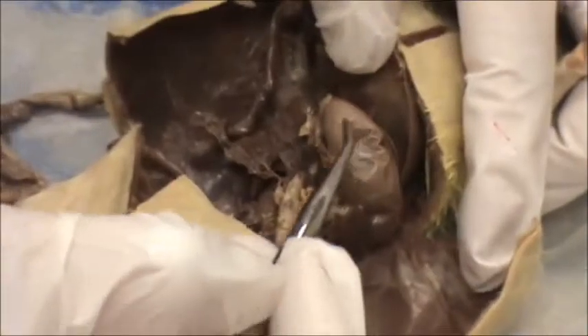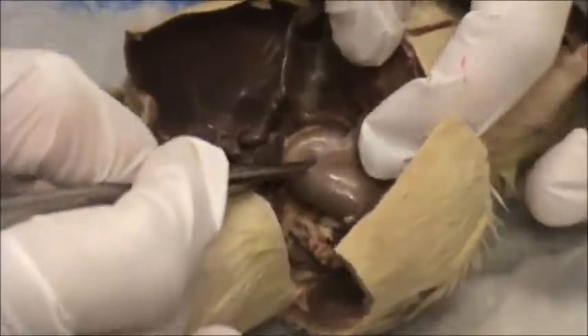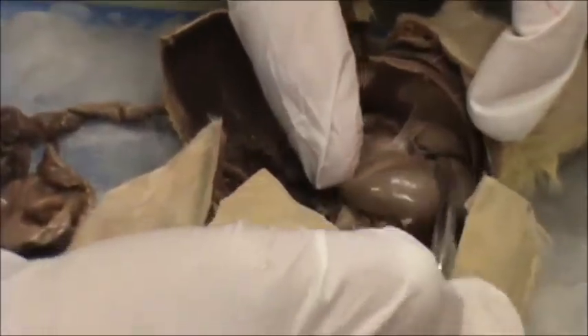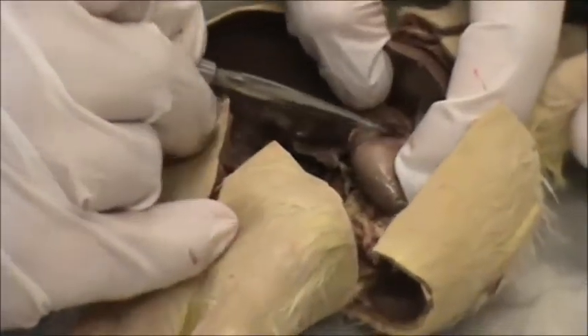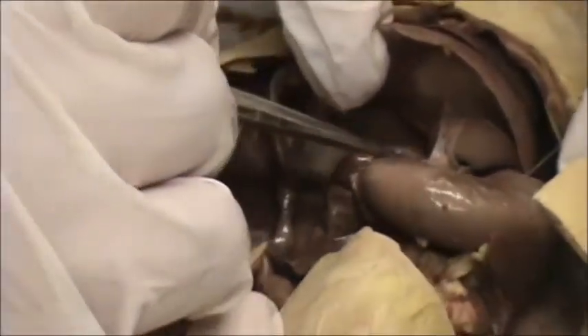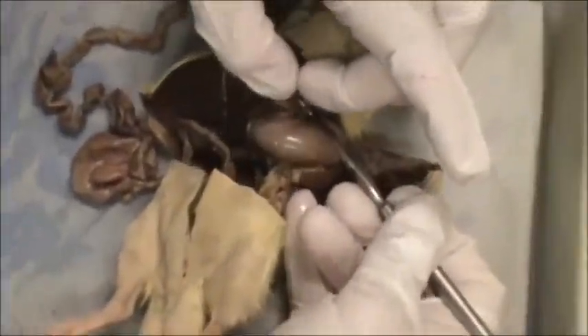Over on the side of the liver is the spleen — they like to call it a banana shape. And then above the spleen is the stomach. Attached between the stomach and the spleen is another membrane called the greater omentum. These membranes keep the stomach, spleen, and liver all attached so they don't move around. Now, the stomach has three regions: you have the cardiac region, which is by the heart; the middle region is called the fundic; and this region over here by the small intestine is called the pyloric. You have valves between the entrance and exit of the stomach that keep the food moving through. And here is the esophagus leading into the stomach.